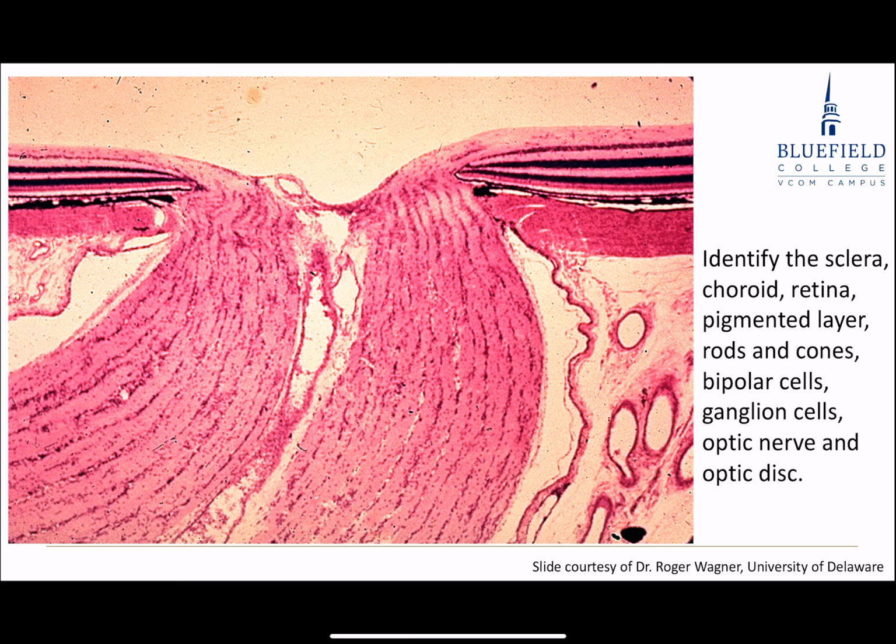It's a little bit overstained, so let's say the line would normally be about right through here where you can see it being myelinated. Looks like the line's up here a little bit closer. That may be the case on this individual, or it may just be a little bit overstained. You can see blood vessels here inside that optic nerve.